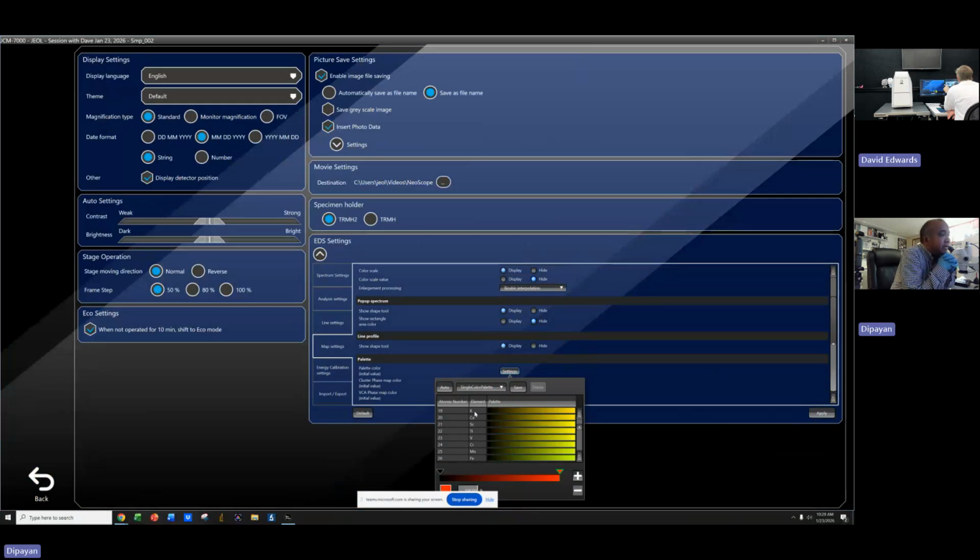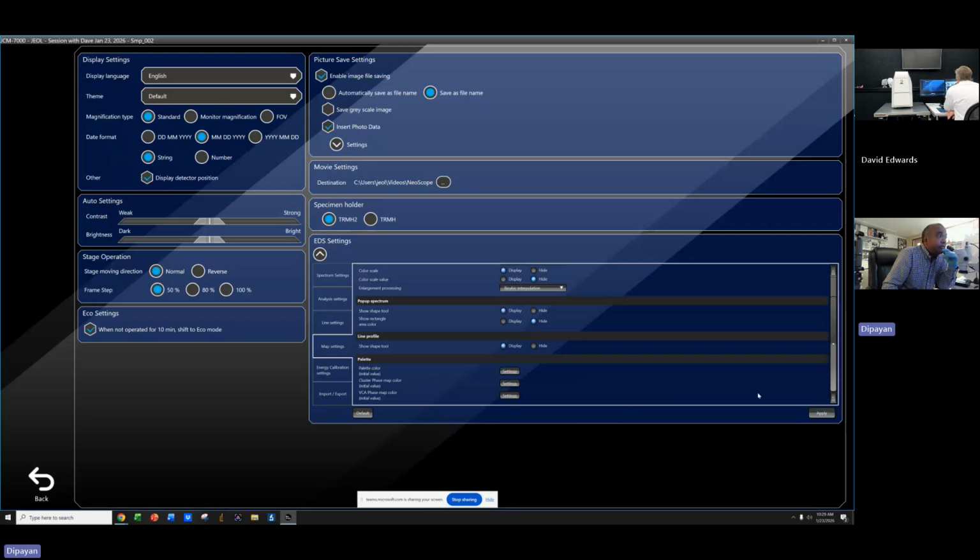Yeah, but I have to first find out how they show up. Then I can decide which color shows up better for which element. Exactly. So right now, just use auto. Yeah, for now I can do auto, but then I understand. So I don't have to worry about playing with color every time. Yep. Because which element gets which color depends entirely upon how the composite image shows up. Correct. Because the composite image is mixing the color and creating a whole new color. And that's what my concern is. I'll come to that point and show you.